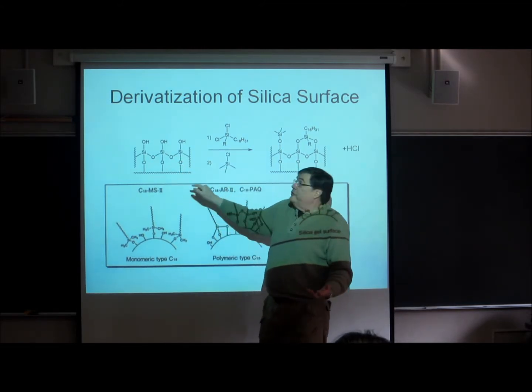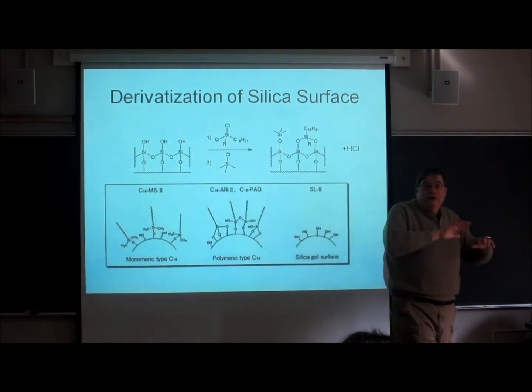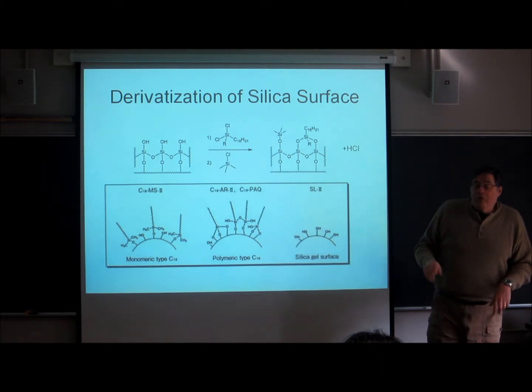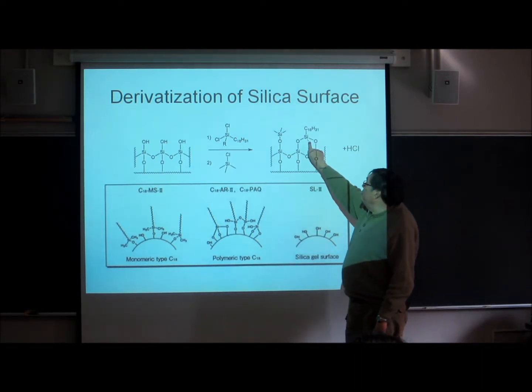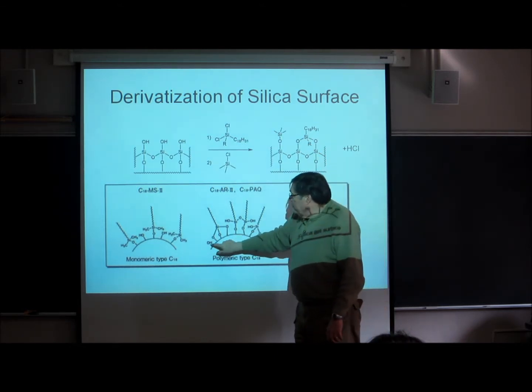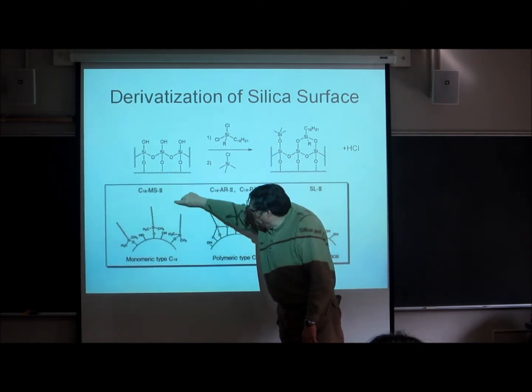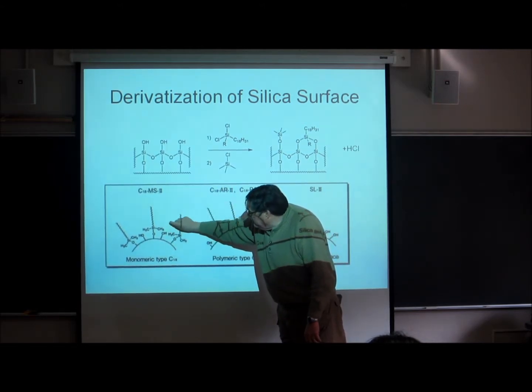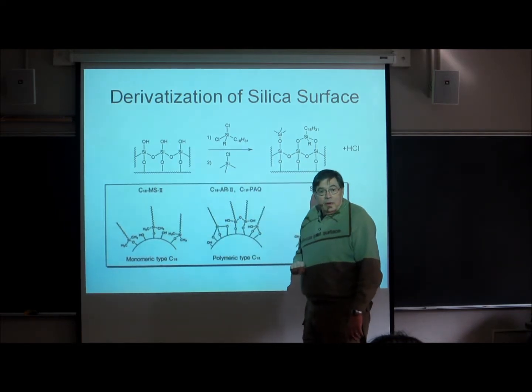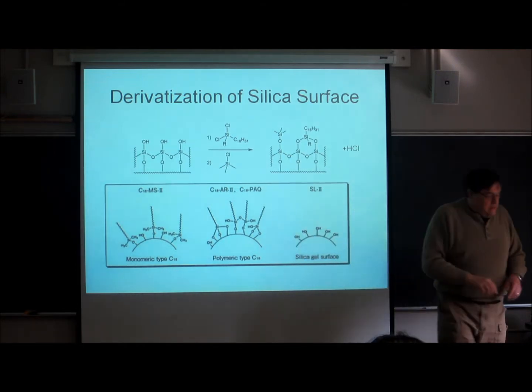In the finished product, there's still going to be SiOH bonds, but we hope to protect the surface from them by having these other groups bonded. Now remember that 2 methyl groups on this silicon here will also help shield the surface hydroxides. Here we see the methyl group helping to shield this one so that adventitious molecules coming in may not be able to get down to that hydroxide very easily. They're kept away from it. So there's this shield defense. All right.